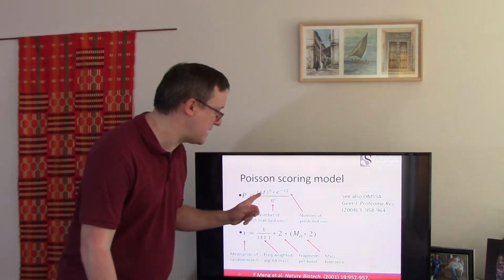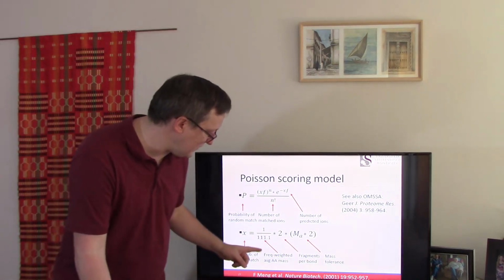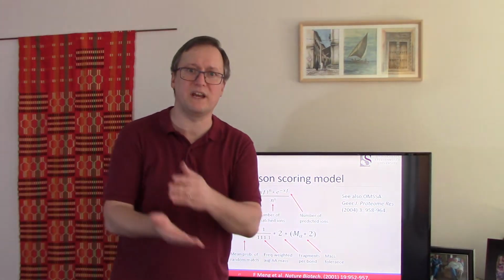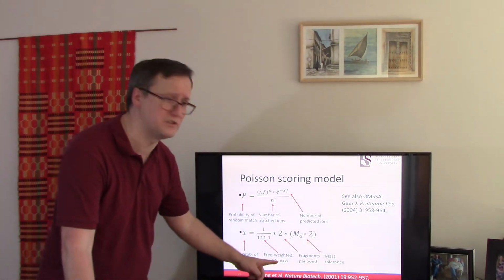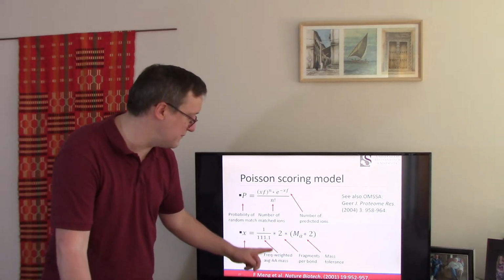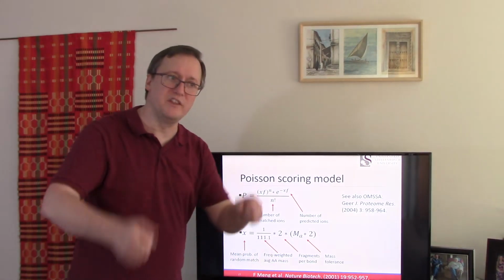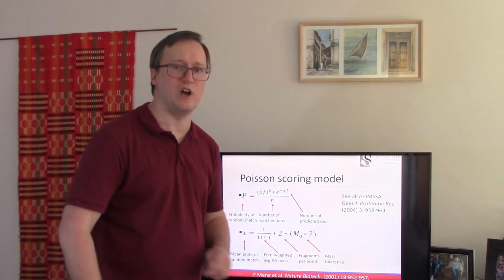Now I said we were going to come back to X. This is our probability of a random match. So we need to know how busy the tandem mass spectrum is. How densely packed do we expect the fragments to be along the x-axis? So we take into account the frequency-weighted average amino acid mass, which is about 111.1 Daltons. We know that each peptide bond that breaks has 2 fragments that it produces. And we have a mass tolerance.